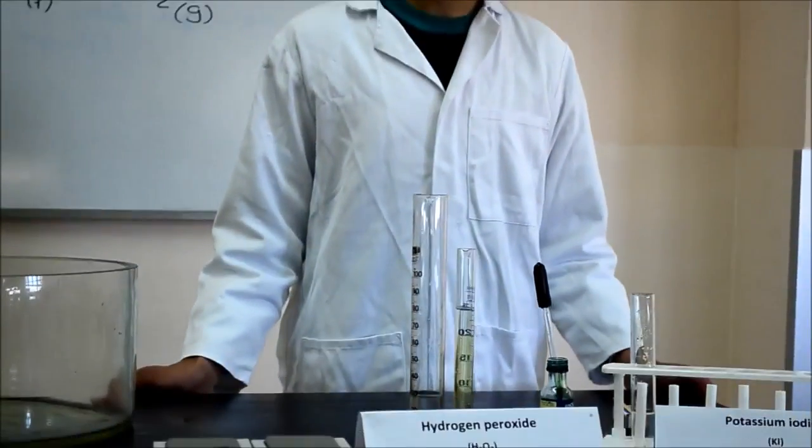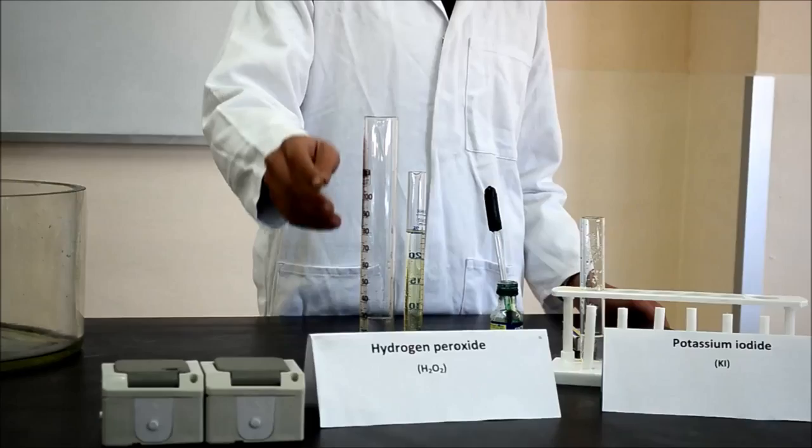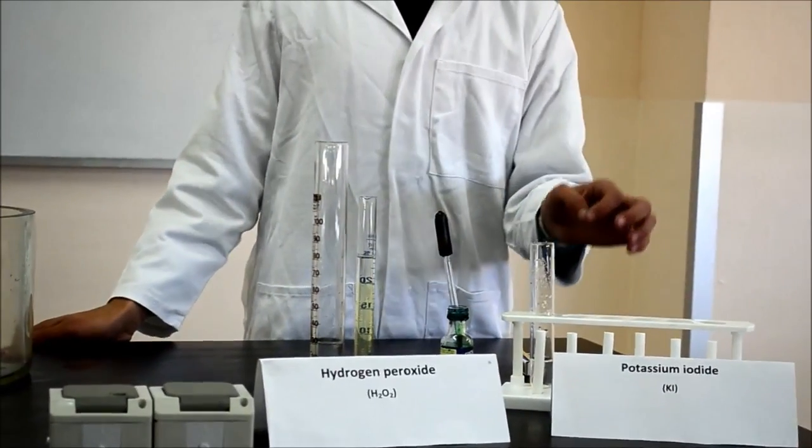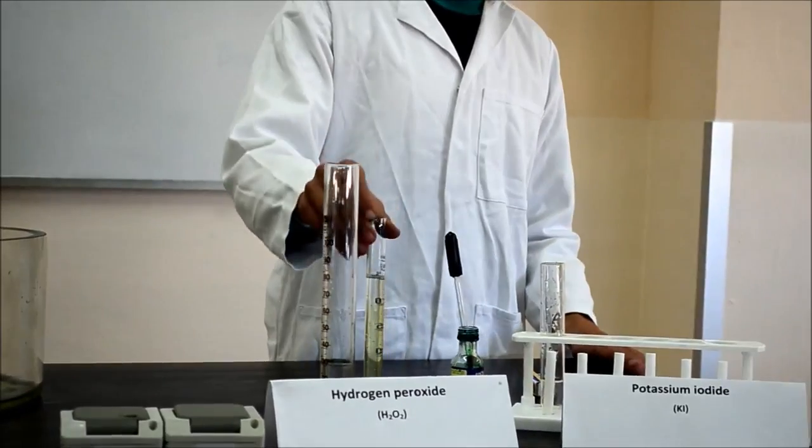For our experiment, we will be using 30 cm³ of 30% hydrogen peroxide, potassium iodide solution, and some soap and food coloring. These are just for visual effect.